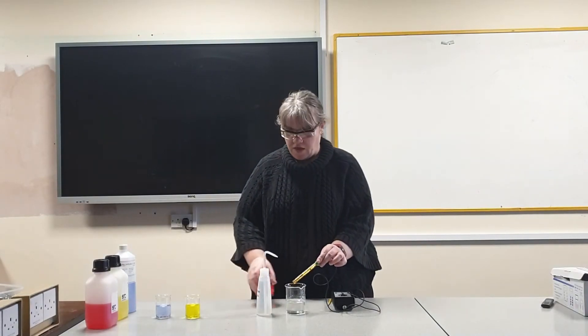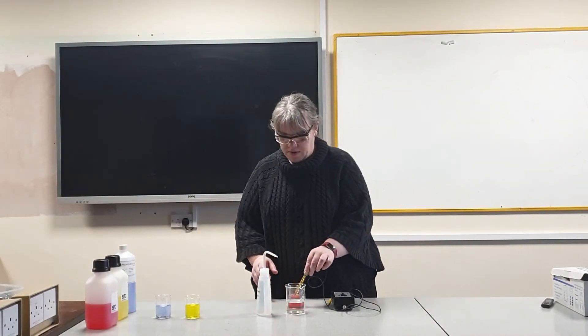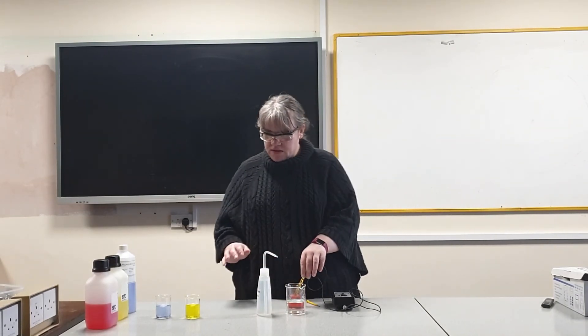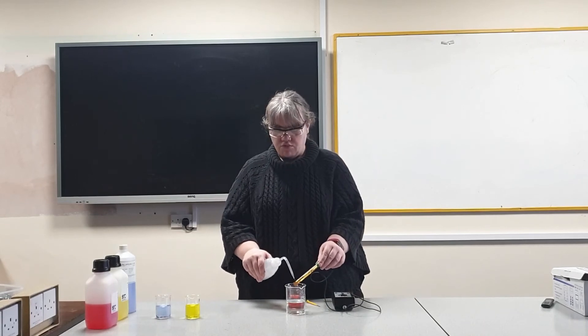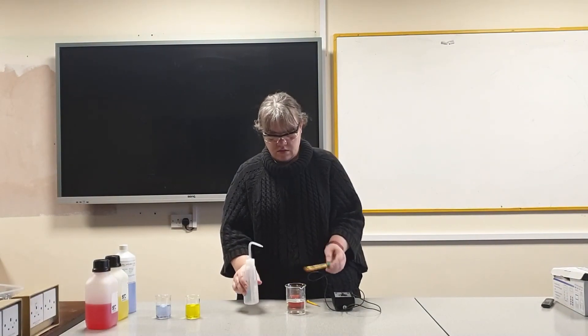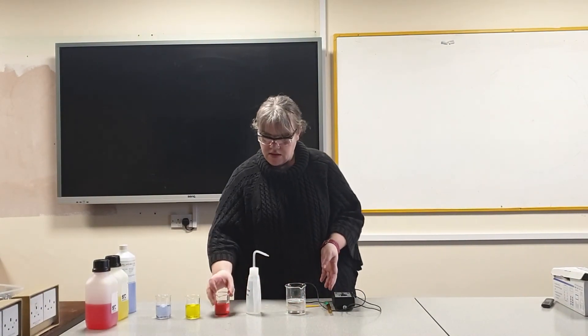Repeat this with the other buffer solutions that are available, making sure that your calibration screw is adjusted so the pH rests exactly on the correct recording. Once that's been done rinse the probe with distilled water and the pH meter is now ready to use.